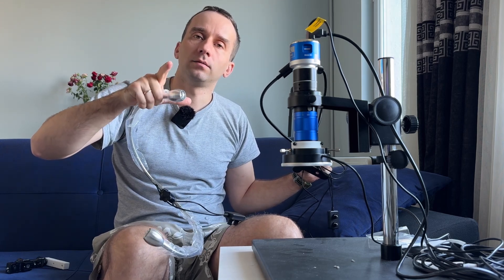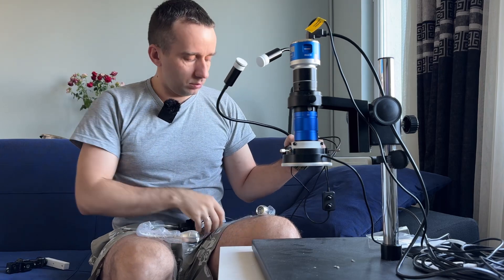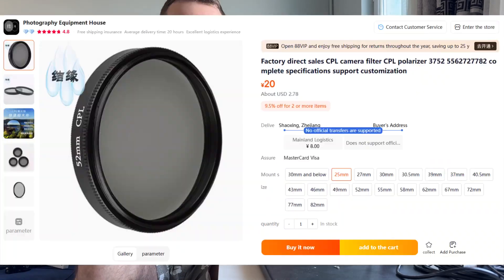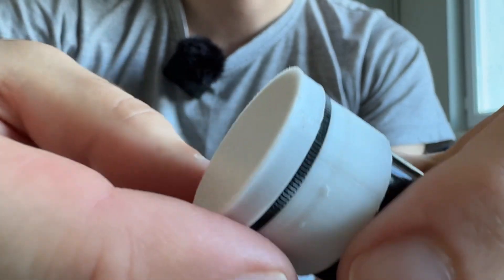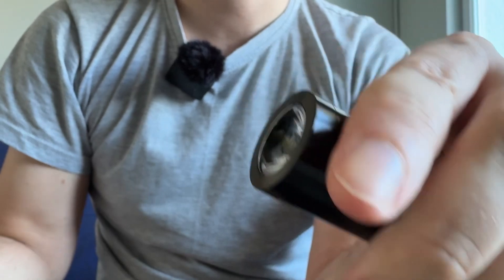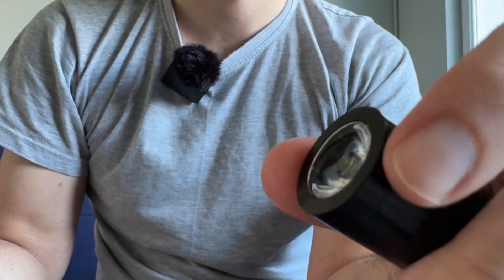Because here the light is too wide, I don't need it. So I rebuild this one. For any light we need a CPL filter. I bought it for 25 millimeters. Look what I made — here is a simple LED light.